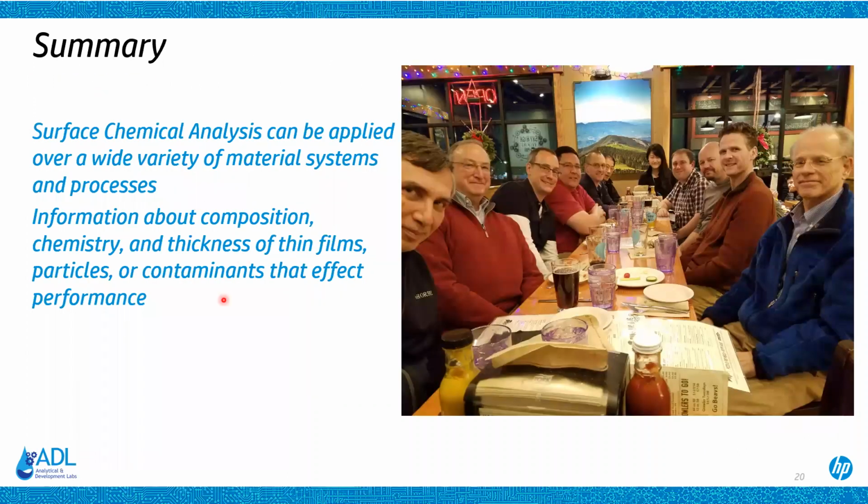Finally, I hope I've been able to tell you a little bit about how we've used surface chemical analysis on a variety of the material systems that we see coming through our laboratory. We get information about composition, chemistry, thickness, and information about particulates and or contamination.